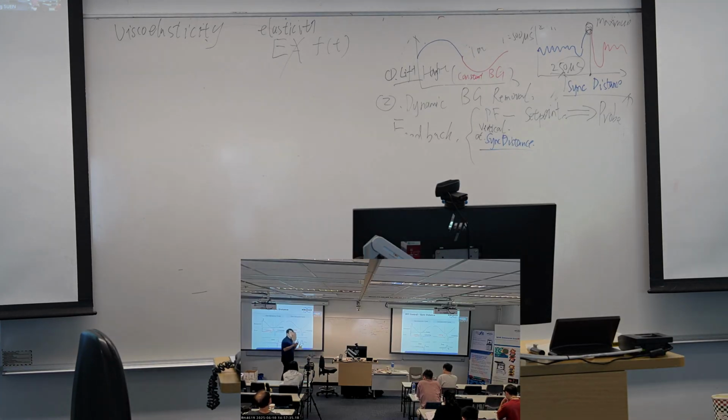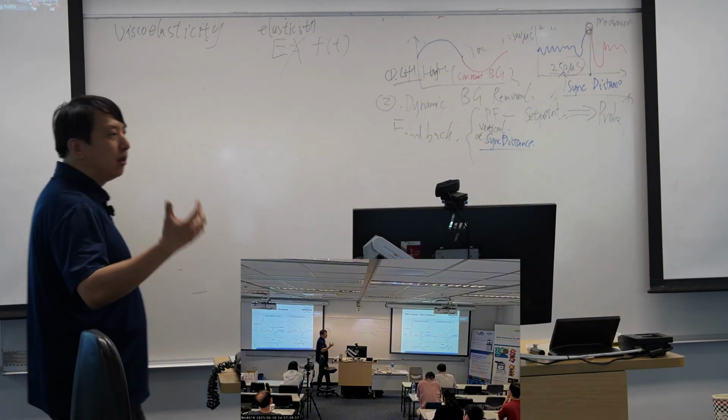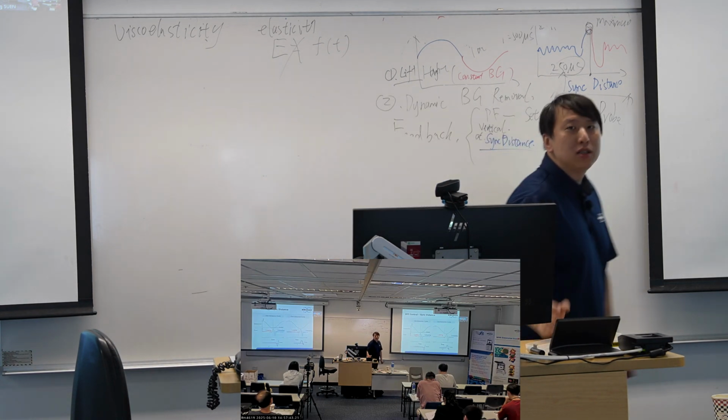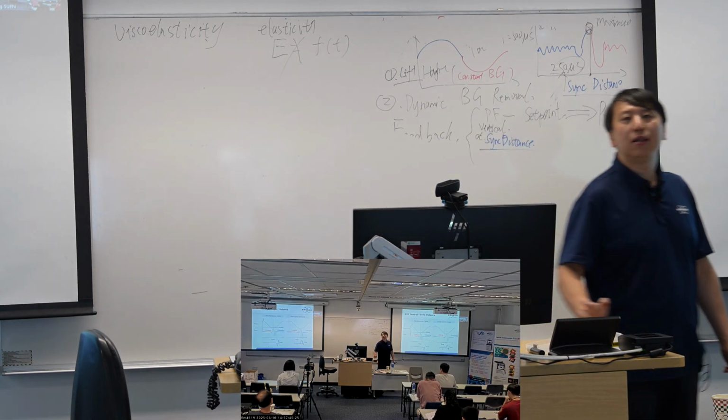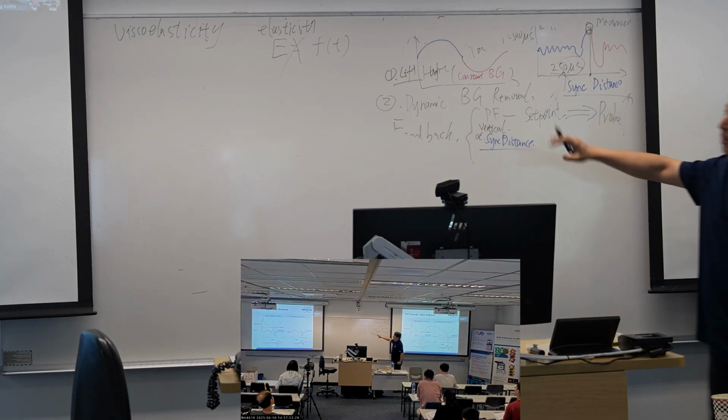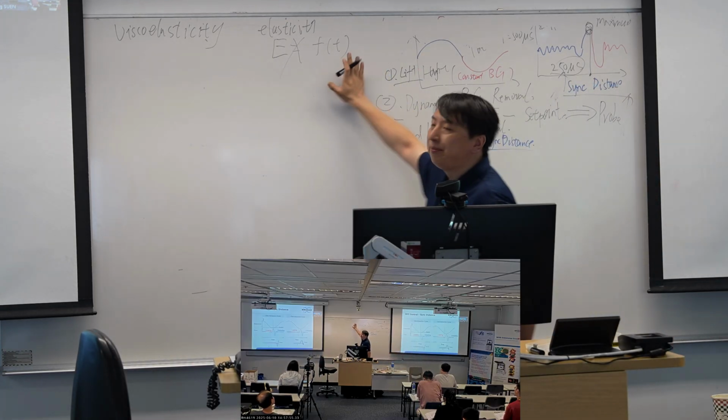For example, you measure the modulus of silicon. Today you capture 165. Tomorrow you should also get 165. After 1,000 years, you should still get 165. That's what elasticity means. It has nothing to do with time.